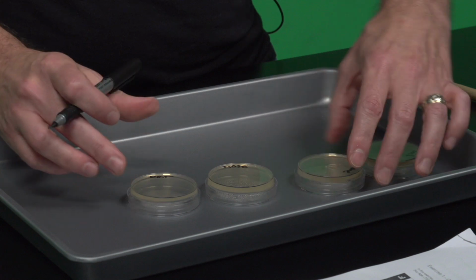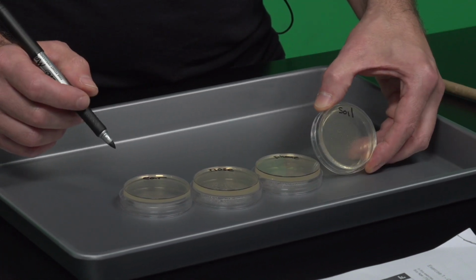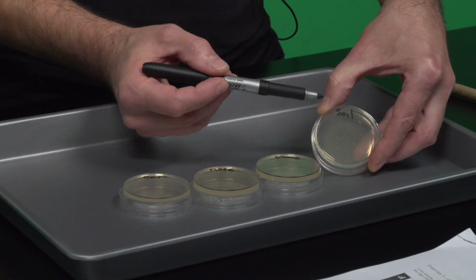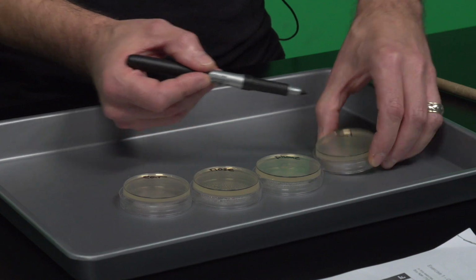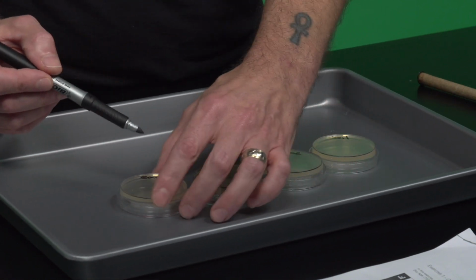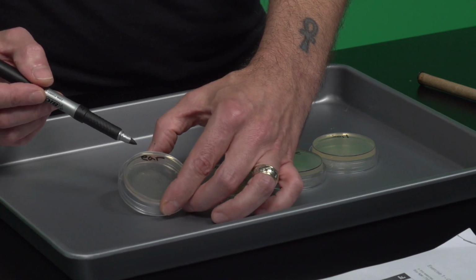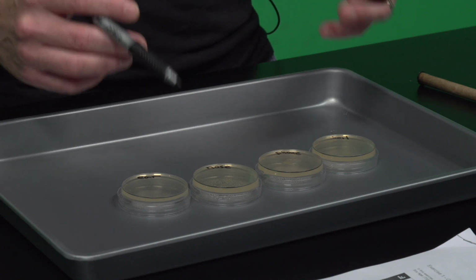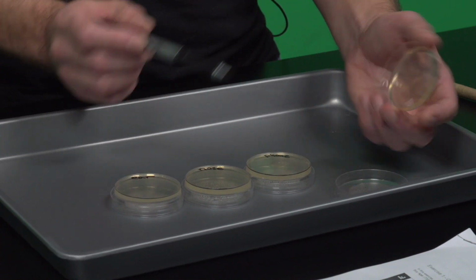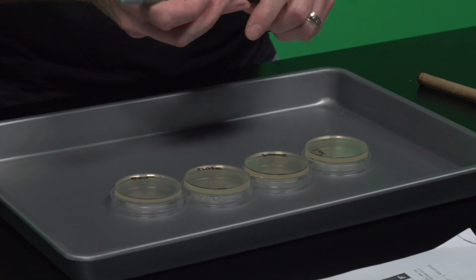What you'll notice is where I labeled them, I did not label them in huge letters, and I did it in one section. Wherever I labeled this, that is going to be my quadrant 1. That is where I am going to actually swab my sample, so it's kind of a marker. Now when I go outside or wherever and I'm swabbing, I know that where I'm going to put it is directly over the marking. So let's go ahead and do that.